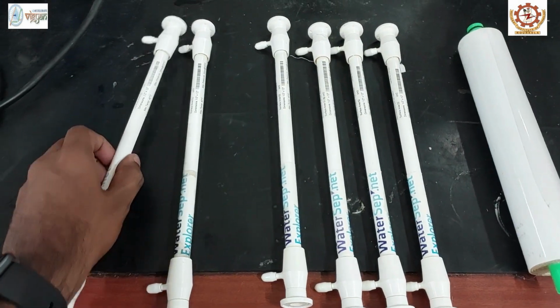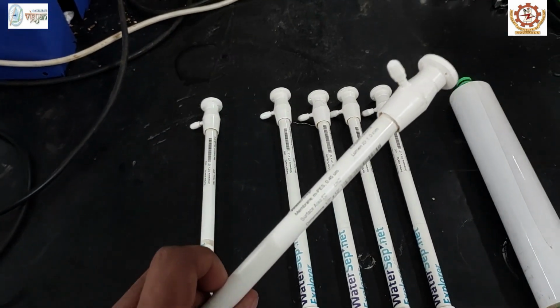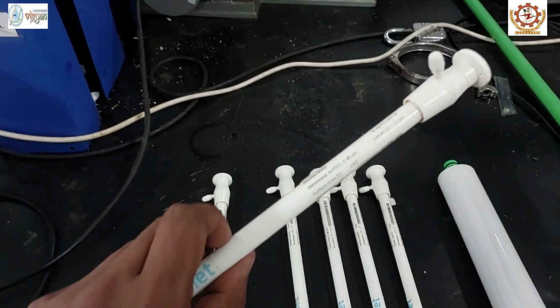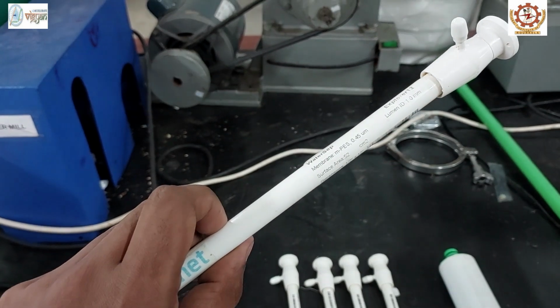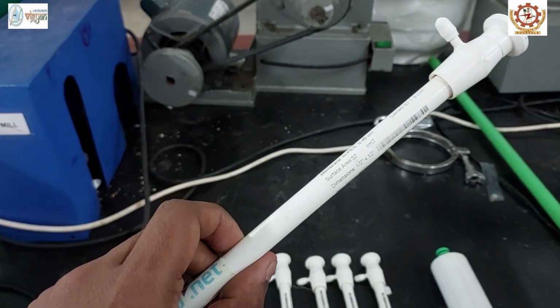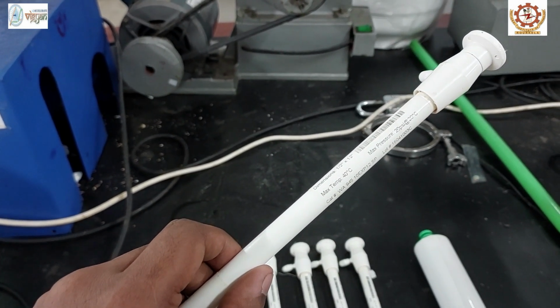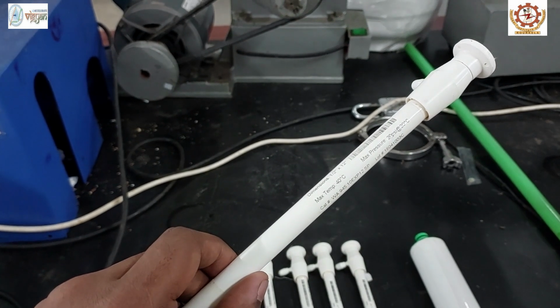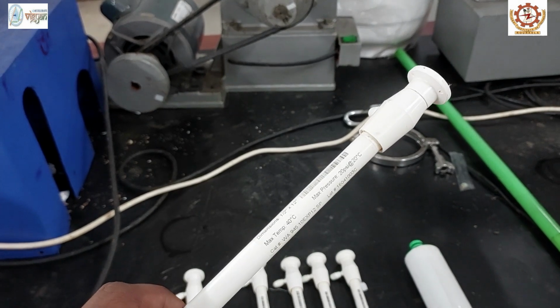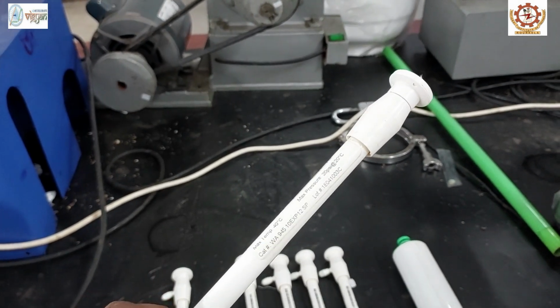For example, this is a microfiltration membrane with a pore size of 0.45 micrometer. You can see it is written there, and a surface area of 52 centimeter square. It has a maximum temperature capacity of 40 degrees Celsius, and it can withstand a maximum pressure of 20 psi at 20 degrees Celsius.